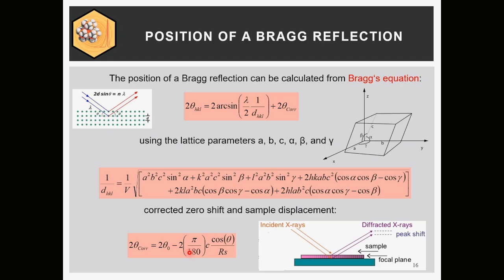If you have a capillary which is not very well aligned, let's say misaligned in x and y direction, and if it's focusing geometry, not completely parallel geometry, then this matters. And therefore you have a more complex expression with sine and cosine functions combined.